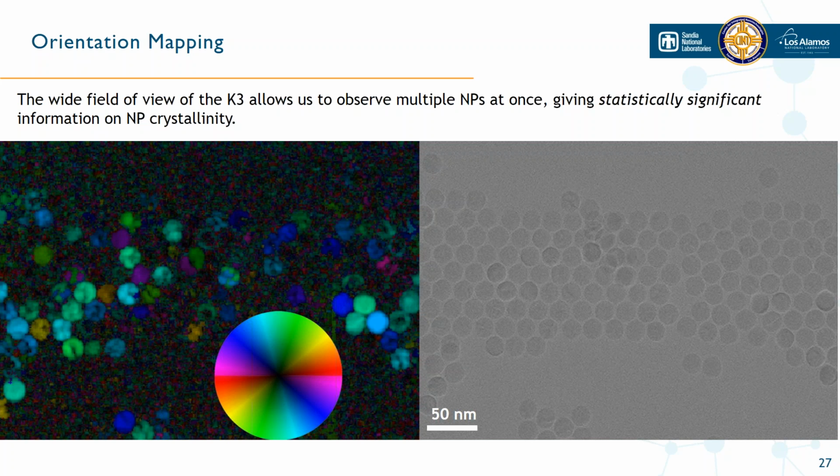because as they dry, you can have things like induced dipoles, which induce some kind of correlation in their orientation. These are superparamagnetic at room temperature, so we would expect them to be oriented randomly, but these induced dipoles can introduce some kind of unexpected behavior, which is really important for us in terms of understanding their behavior in a switching field.